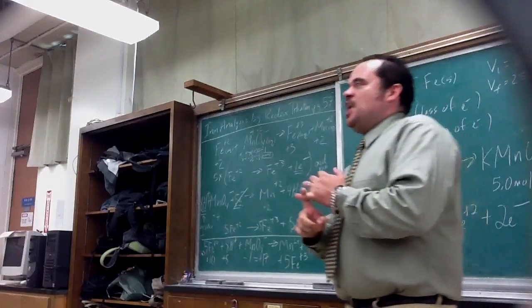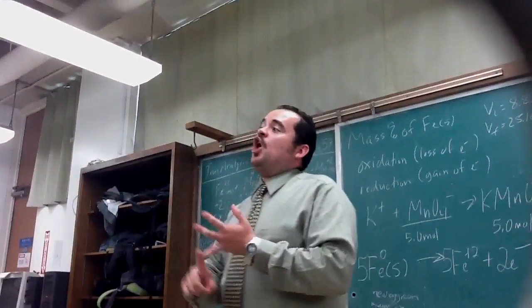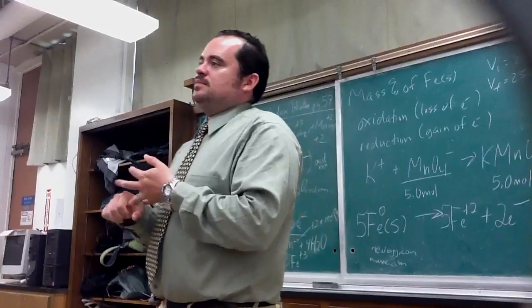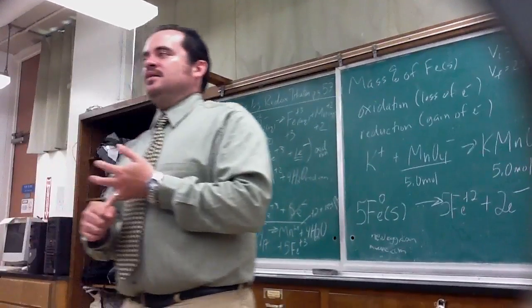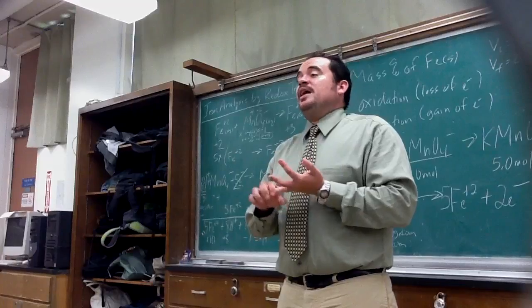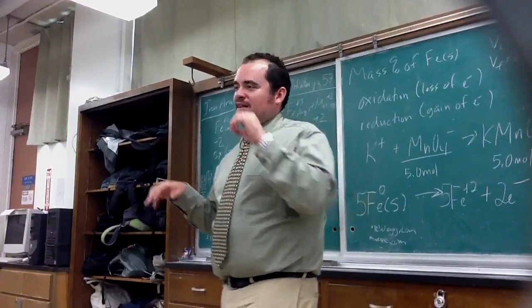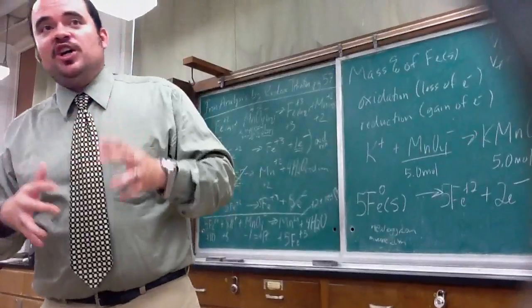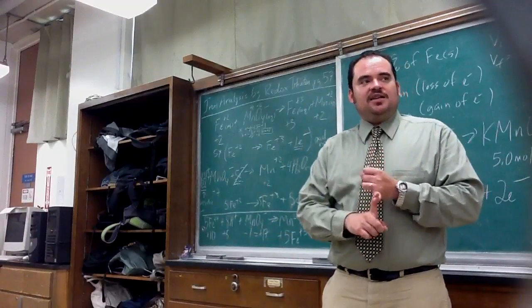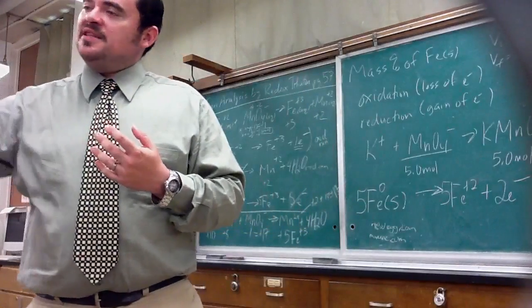So you know the volume of the potassium permanganate that was used to titrate this to reach the endpoint. You also need what else? We want to take the moles of potassium permanganate ion. It's molarity, and that, of course, is written on the bottle they use. So make sure you write that number down as well. You know the concentration of the potassium permanganate. You also know the volume of this thing.